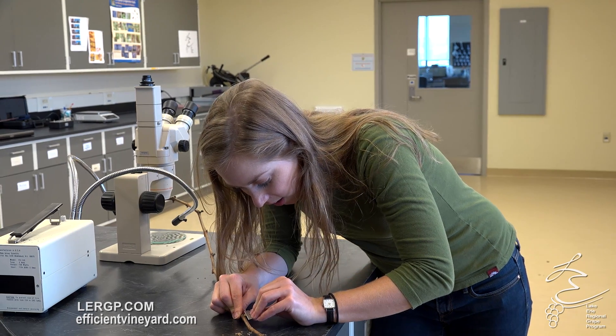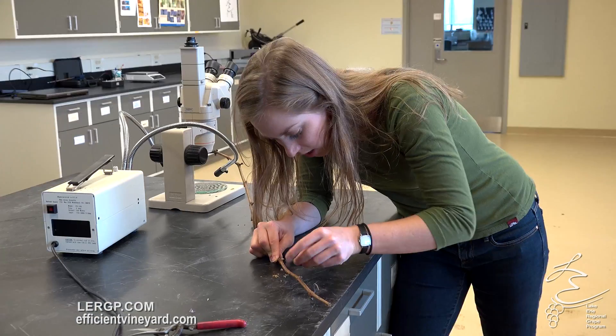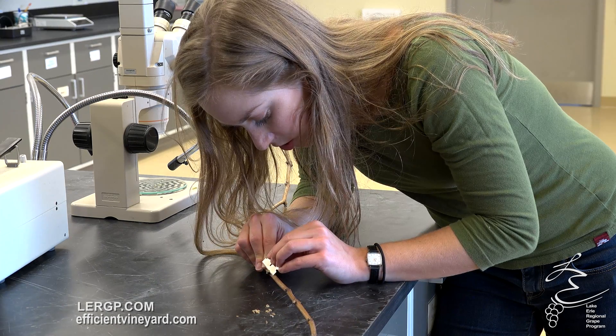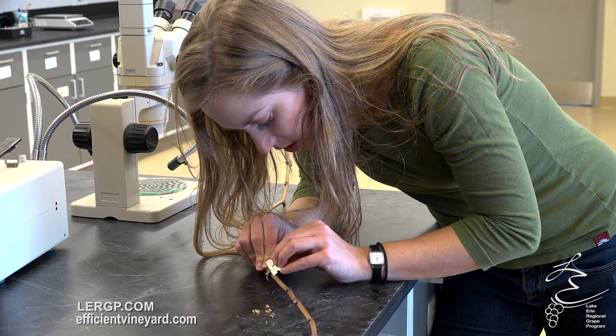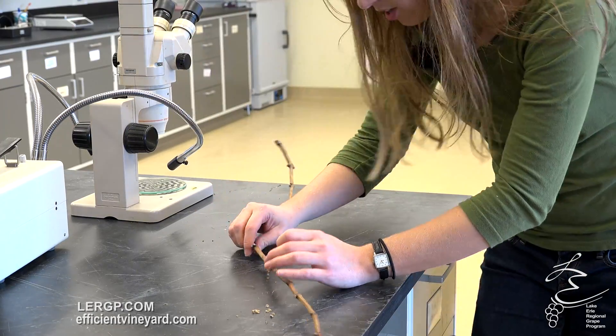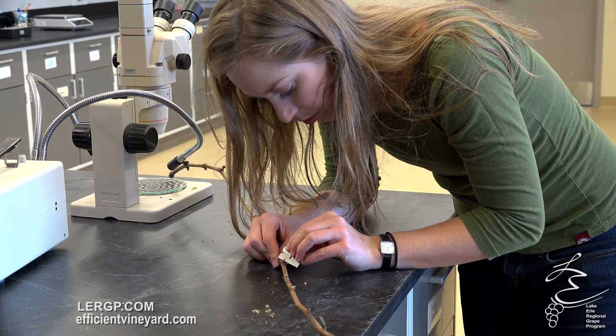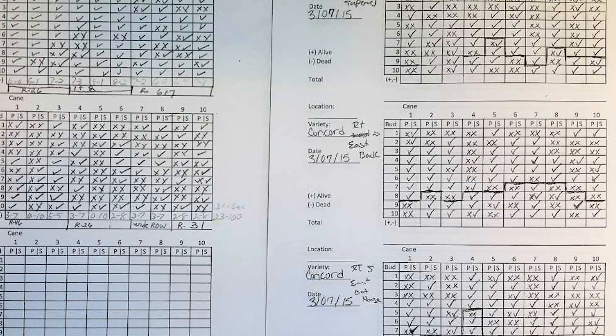We're just going to go down the line here and take a look at all these buds. That one's nice and alive — primary, secondary, tertiary, all still with us. So that's what we want to see. Just going down through each bud, taking a little cross section off at a time. That one is also healthy. We'll get through our 10 buds on this cane and mark down how many of the primaries, secondaries, and tertiaries are alive and how many didn't make it.